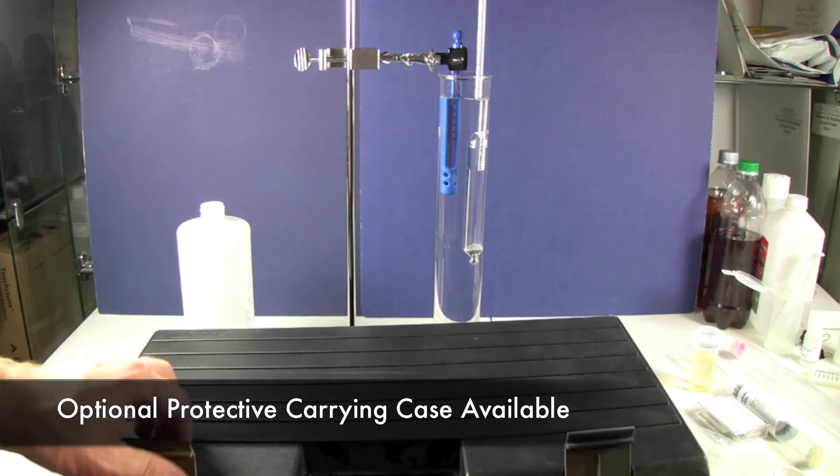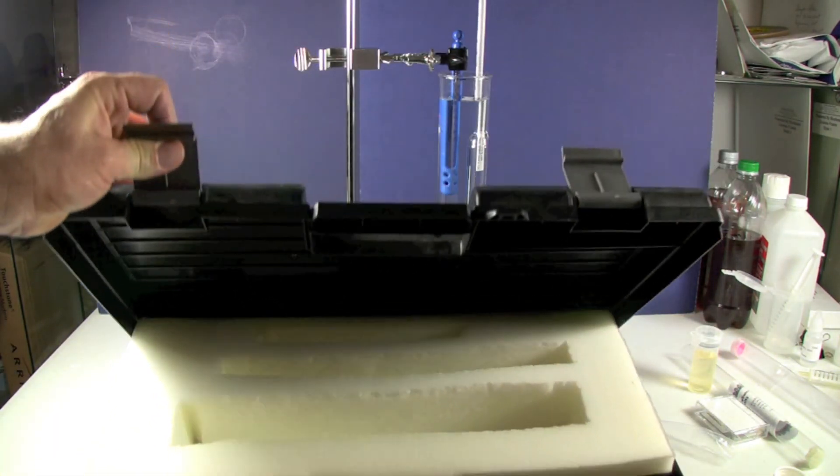It's just a nice case. It's got a foam insert inside, and it's really handy to have around.